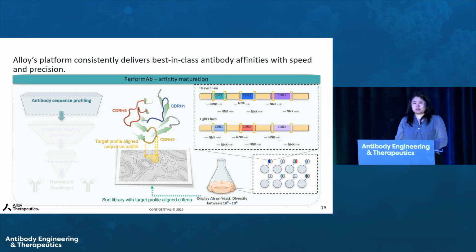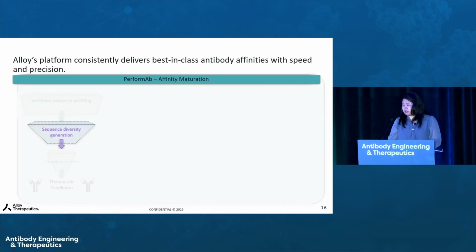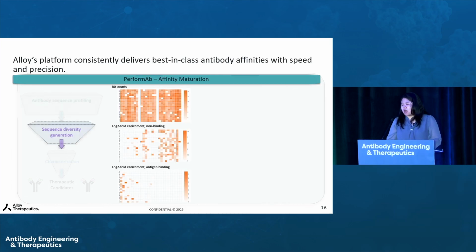And that would essentially allow us to draw a profile chart for our specific wild type sequence. It will tell us what amino acid at what position will give us a beneficial or not beneficial property towards our end goal. And then once we have that profile, we'll look deeper into the sequence itself. And here is just an example of the data that we will typically get at the end of this process.